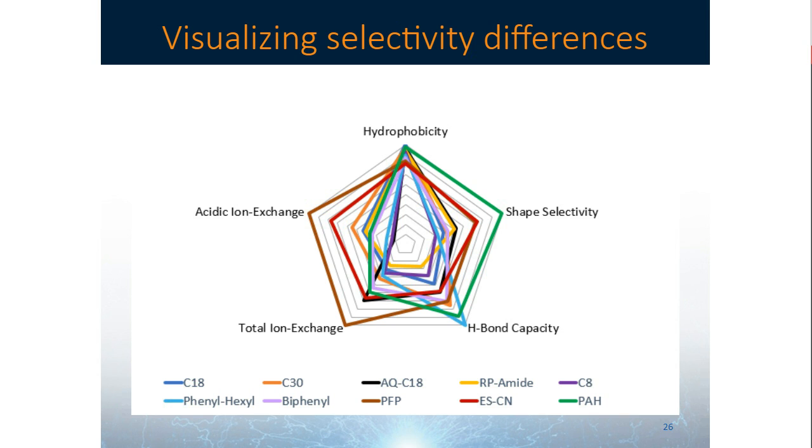You could get away with using isocratic conditions, but in general, people typically use gradient conditions because they have a pretty broad range of polarities for their compounds, and they kind of want to speed things along. So it's a little bit hard to answer the question unless you know how many compounds you're looking at and how close they are in terms of their hydrophobicity.